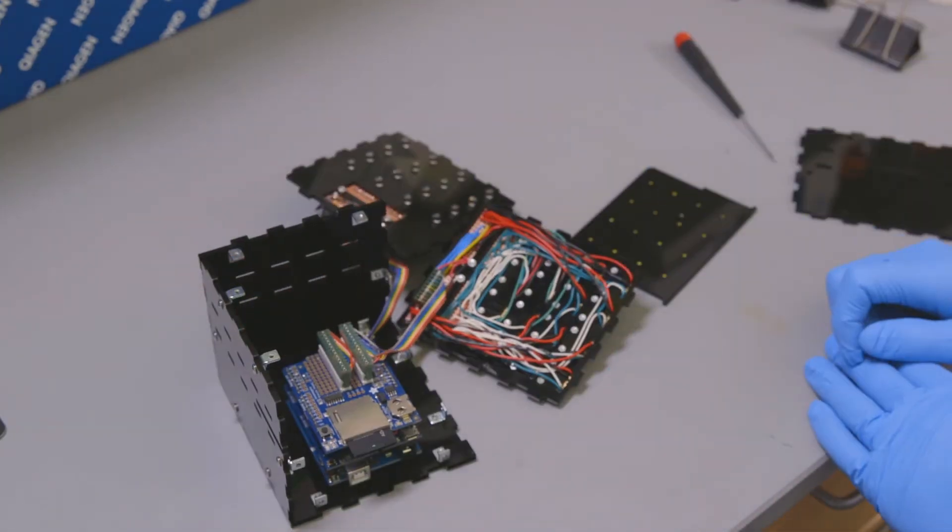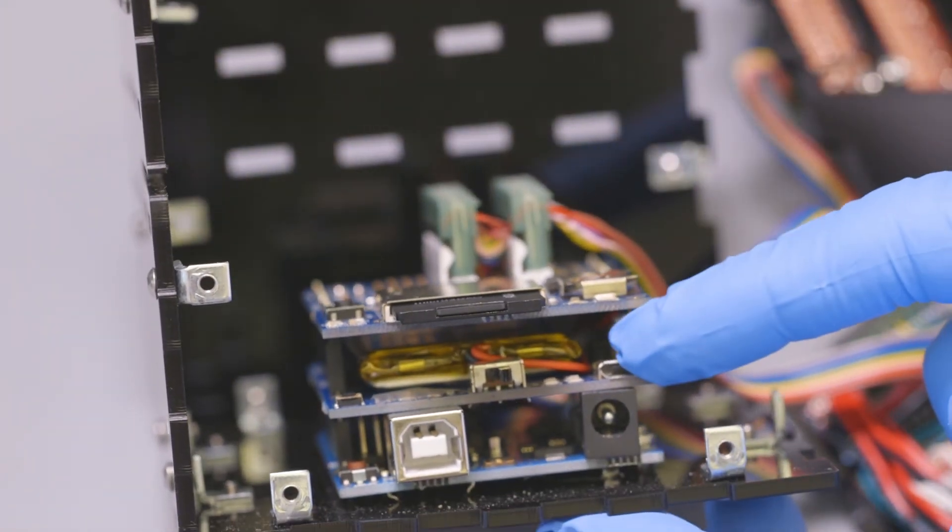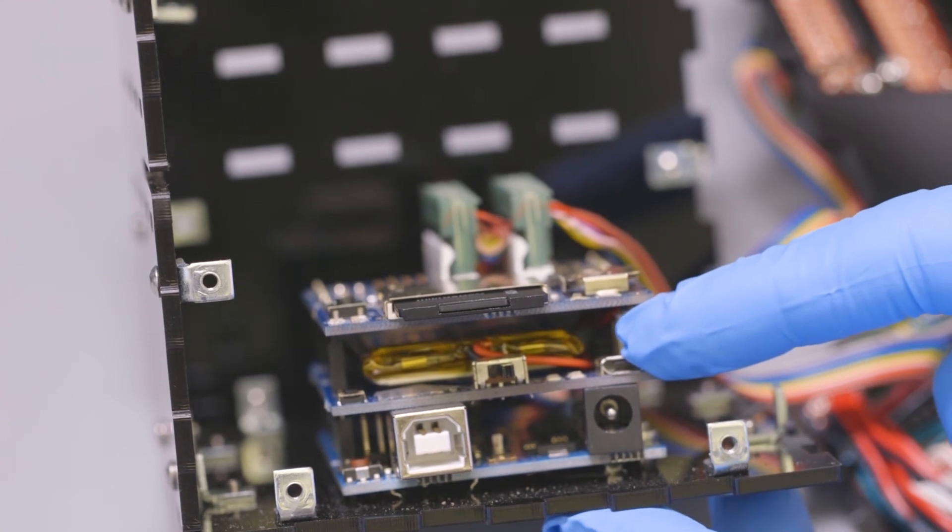The last layer is the bottom stack, which contains the Arduino battery shield and the data shield, which holds the SD card. The reader is powered by lithium polymer batteries, which can be recharged via micro USB.